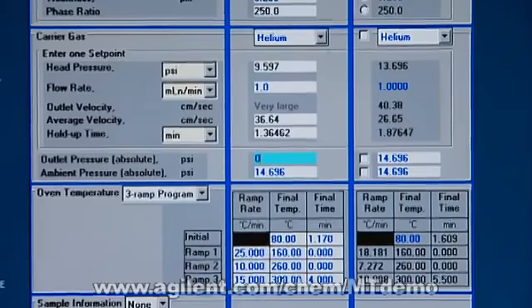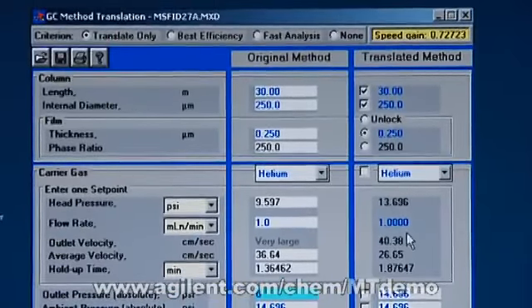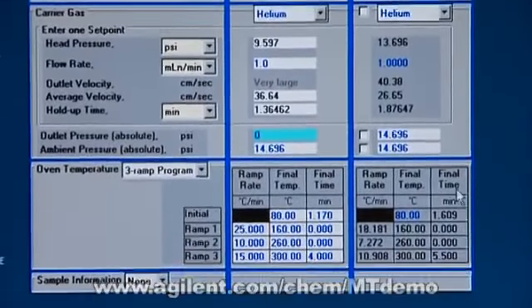If we look at his method over here, translate only, he's got the same column, helium carrier gas, same flow rate, but his outlet pressure is higher. Therefore, his temperature program is different.